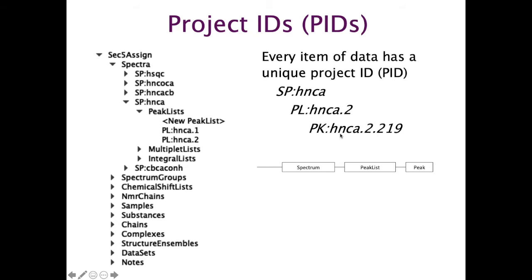Okay, so now we have a means to grab hold of our data items. We've got all these properties and methods. How do you actually know what all those properties and methods are? How can you find out what they are and start using them?